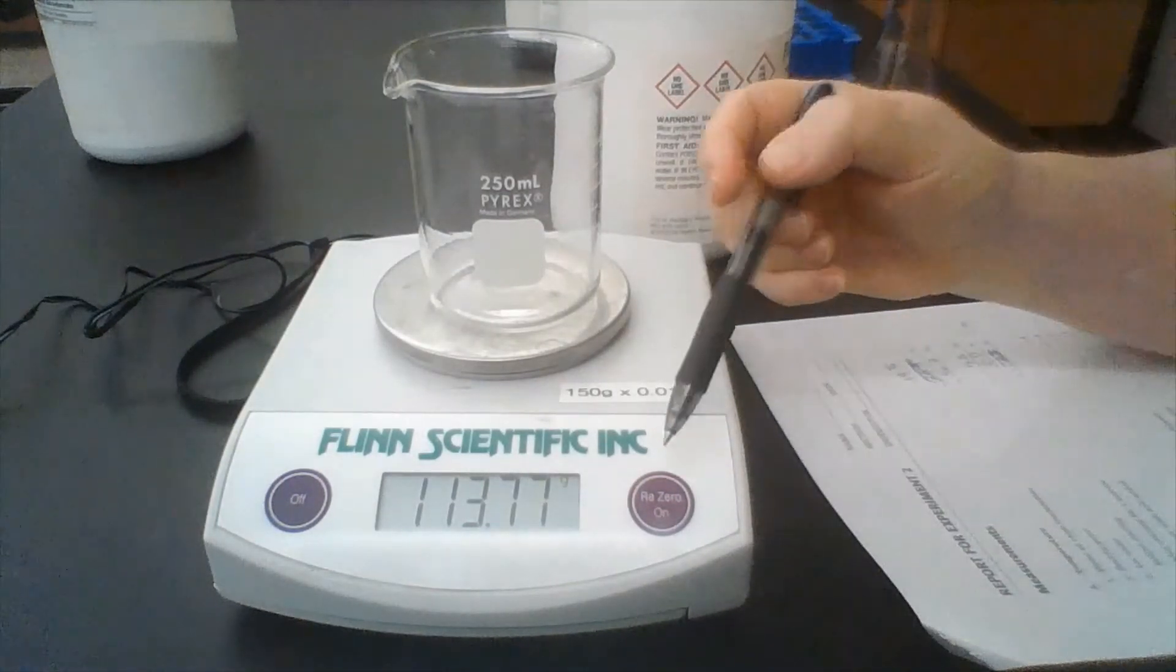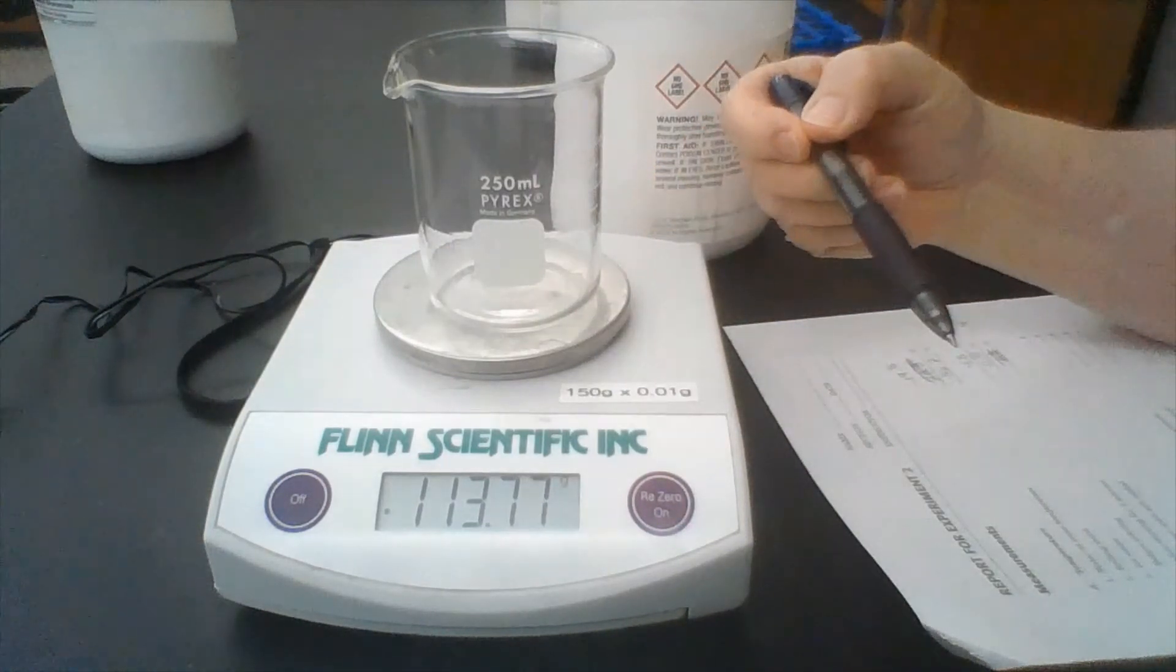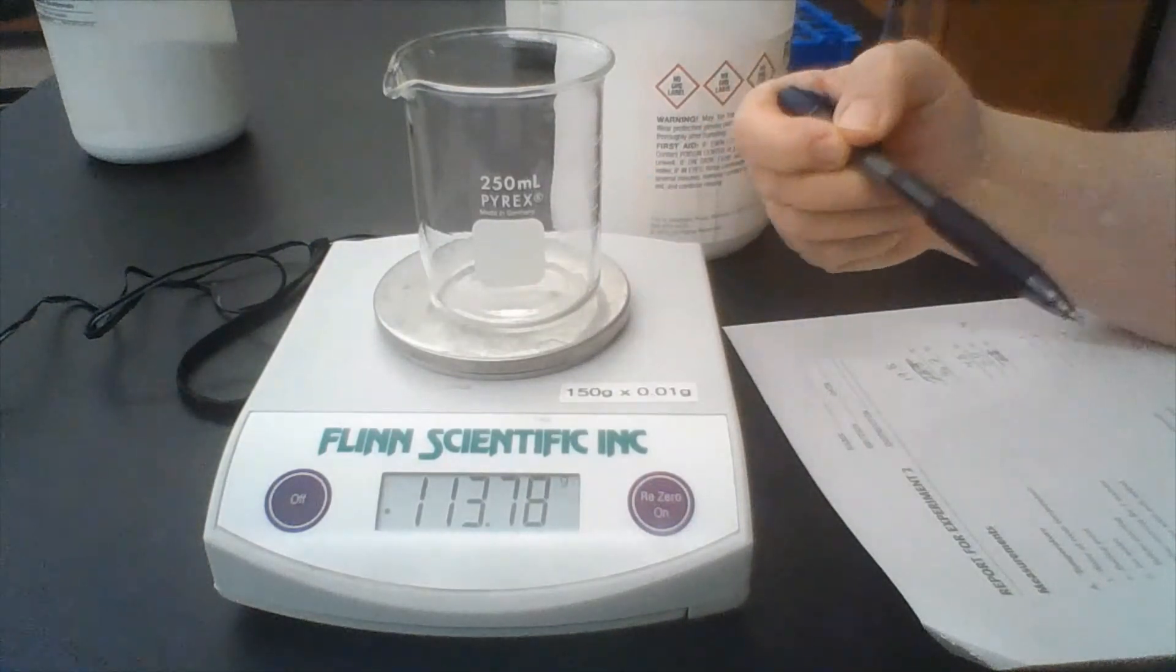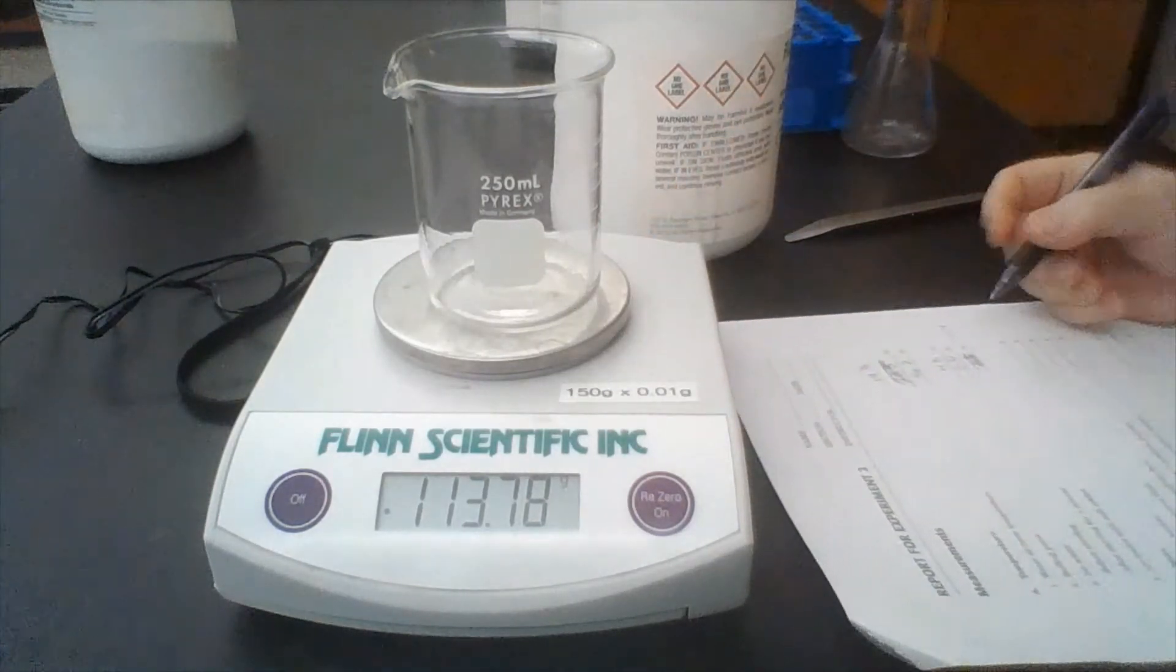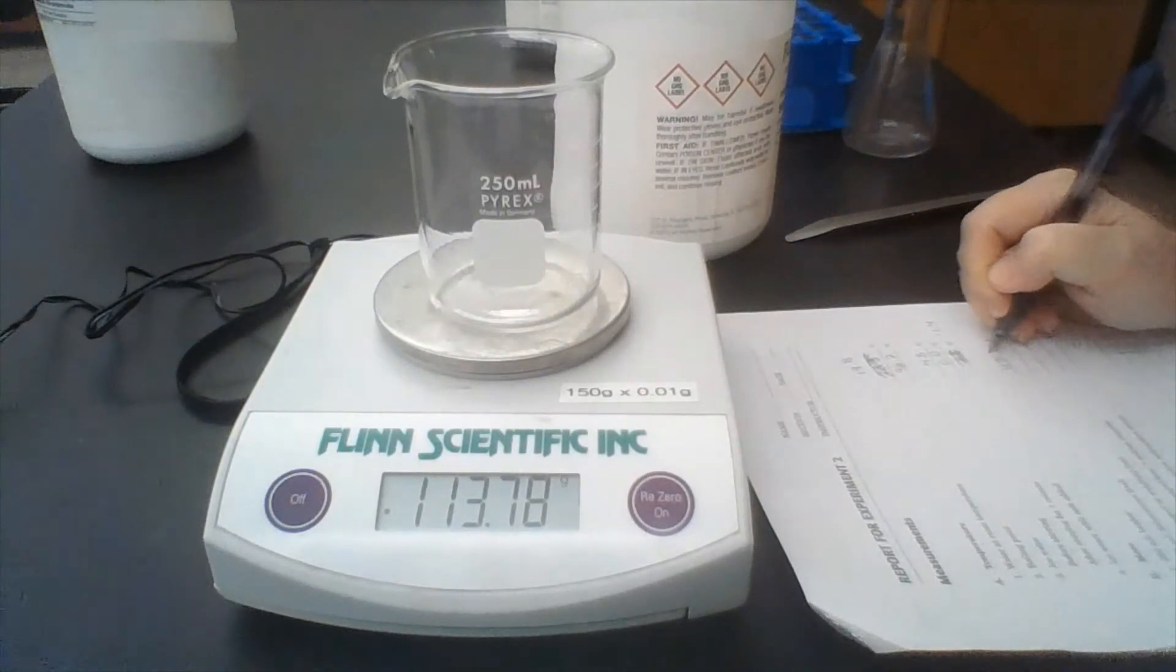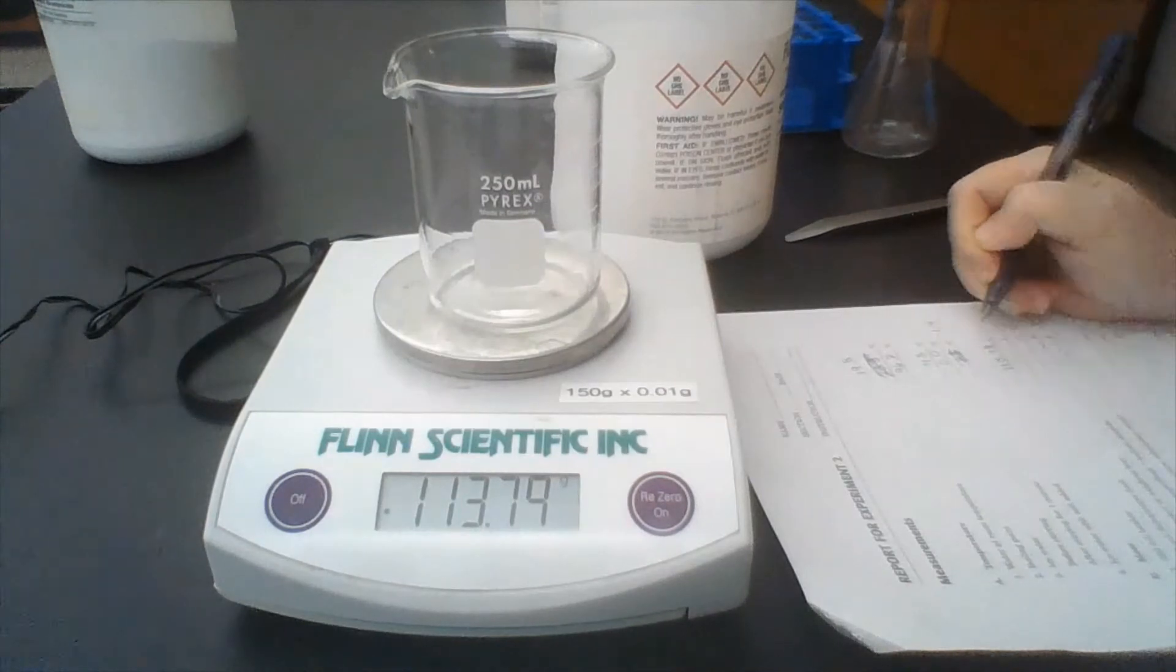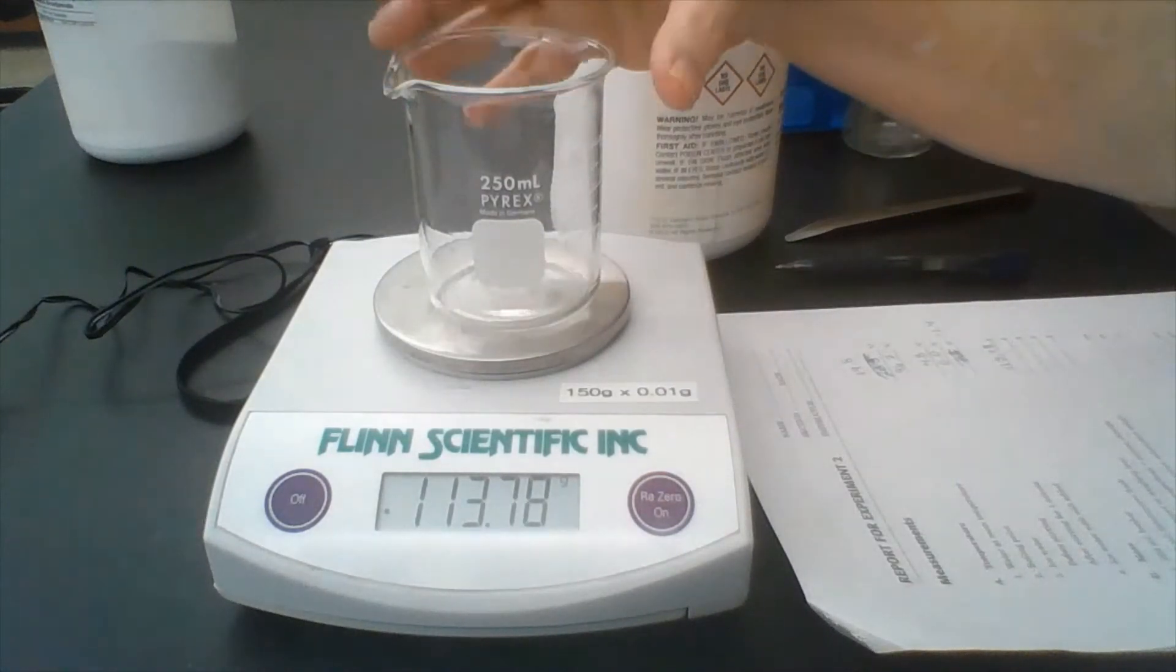So the scale is zeroed, and now I'm going to measure a 250 milliliter beaker. As you can see, this last digit changes, and that's going to be our uncertain digit, but that's okay, it's okay to have one uncertain digit. But I will write down all the digits. That's 113.7879 grams. That's our 250 milliliter beaker.